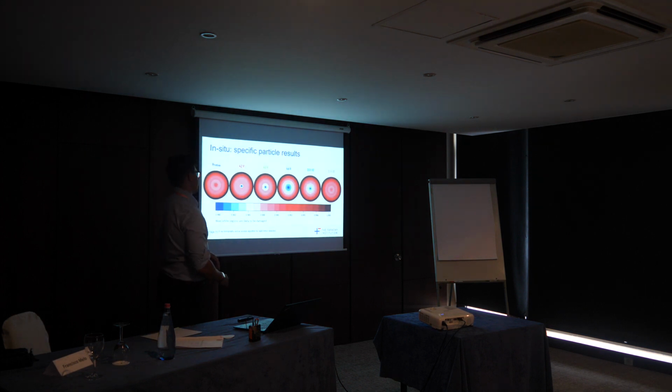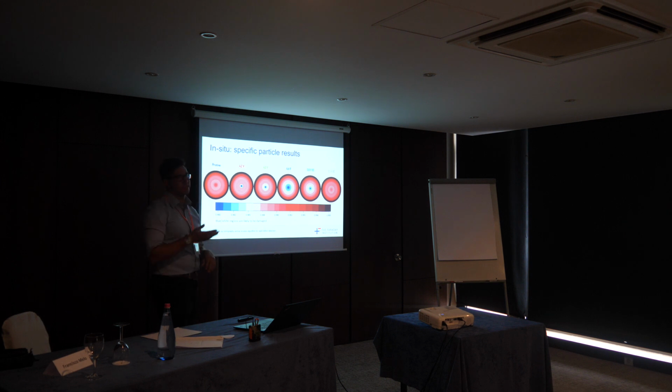And then something that's really nice that we can do with this in-situ work is track a single particle through its life. So here we have exactly the same particle, and this is in its pristine state. When it's never been in the battery, it's just chilling. And then as we take it up to higher and higher voltages and we remove more and more lithium, we can see its intensity in the core goes down. So this lower intensity down to 0.98 is indicating that there are cracks or defects in the center.